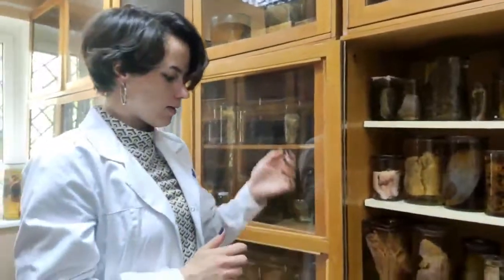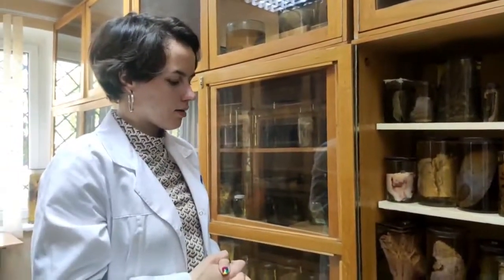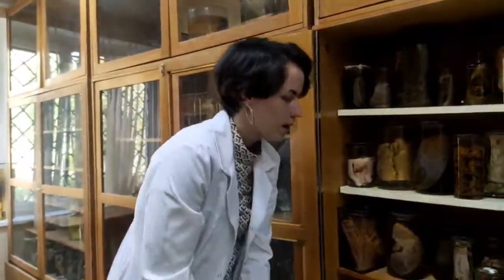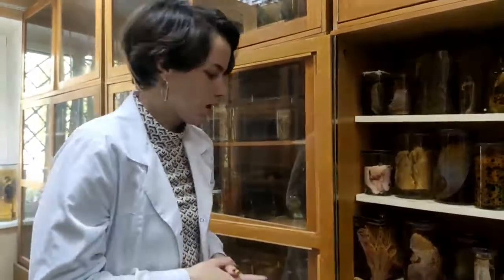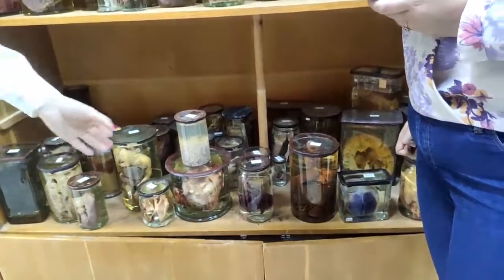We can see microcephaly, porencephaly, pseudoanencephaly, and other disruptions in the brain. If the baby is almost developed, we can see easier forms, for example, meningitis caused by toxoplasma, and some troubles with parenchymatous organs.